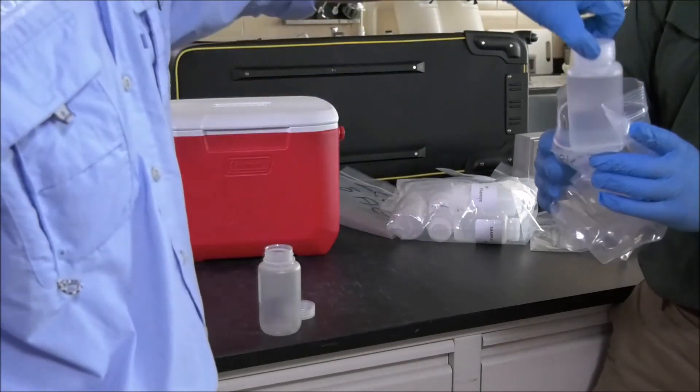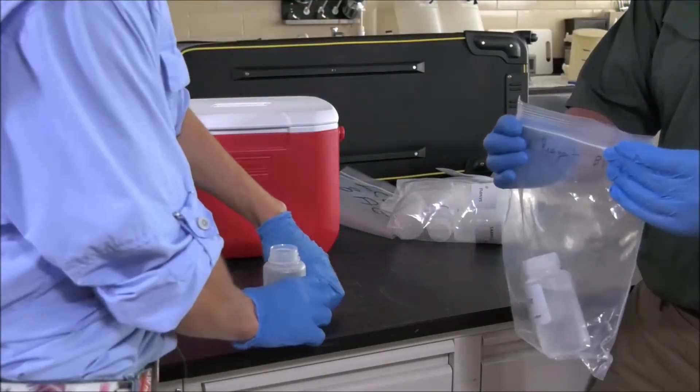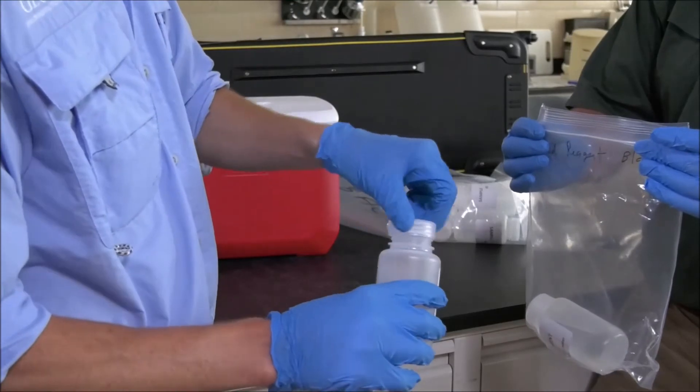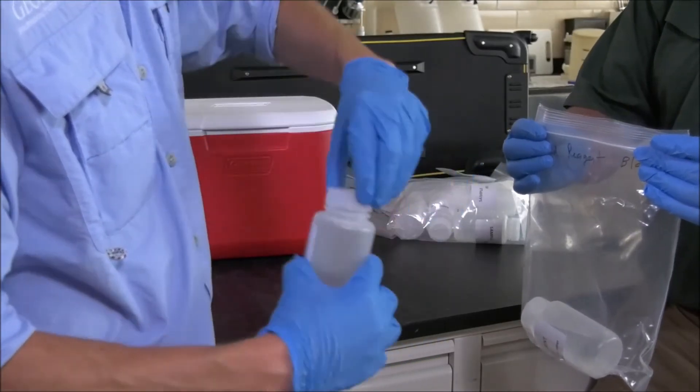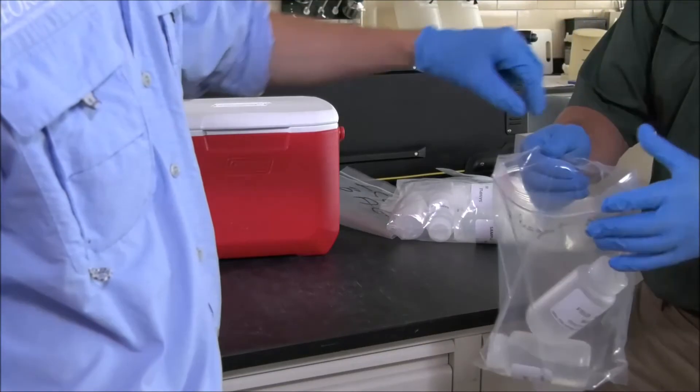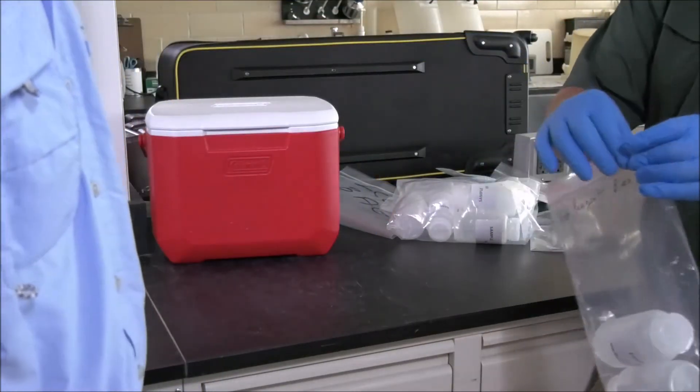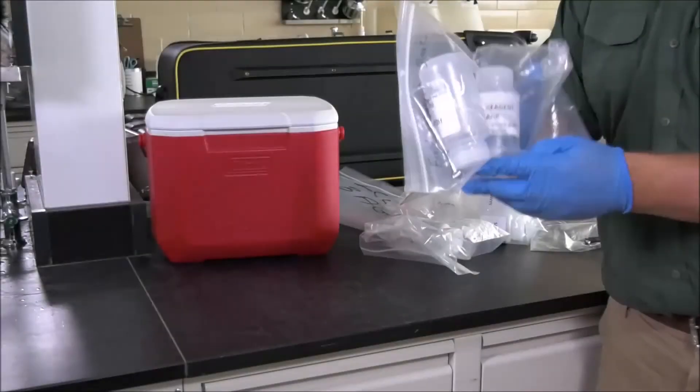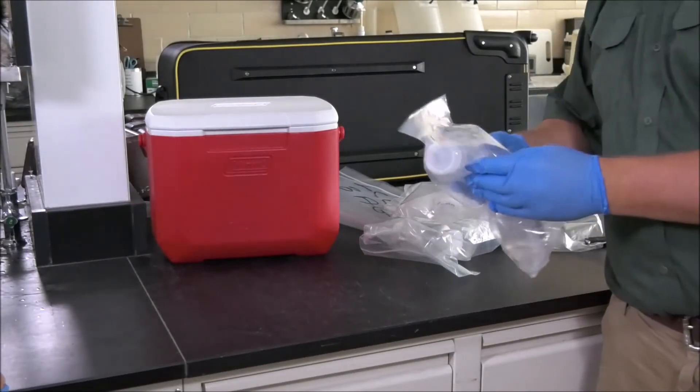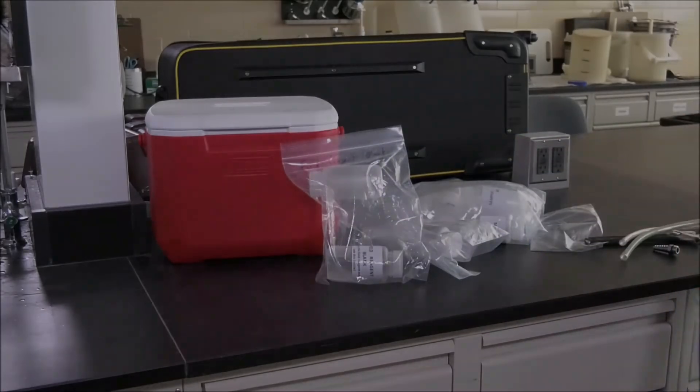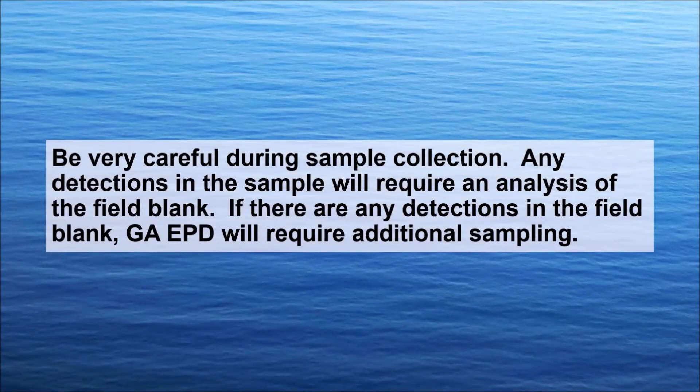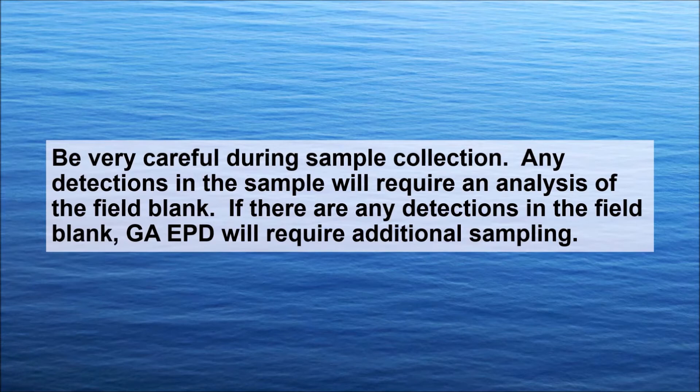As dirty hands is holding the resealable plastic bag open, clean hands will drop all the capped field blank bottles back into the resealable plastic bag they came in. Dirty hands will seal the plastic bag. This same procedure will be repeated with the second set of field blank bottles. Be very careful during sample collection. Any detections in the sample will require an analysis of the field blank. If there are any detections in the field blank, Georgia EPD will require additional sampling.